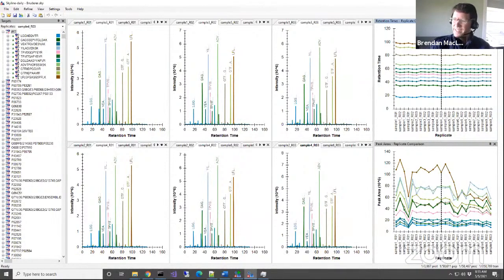No batch effects, yeah, maybe. But in terms of how the person who collected the samples ordered their data, what I'm going to learn when I do order is just how they ordered their data on the mass spectrometer. And hopefully you're like, oh, I hope they did randomization, and what else?